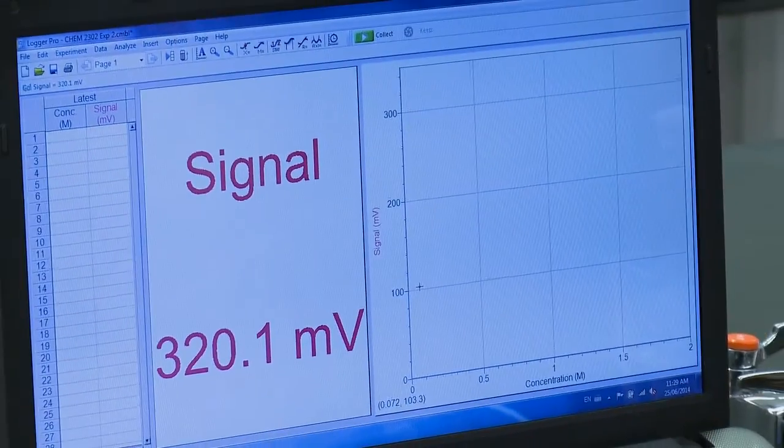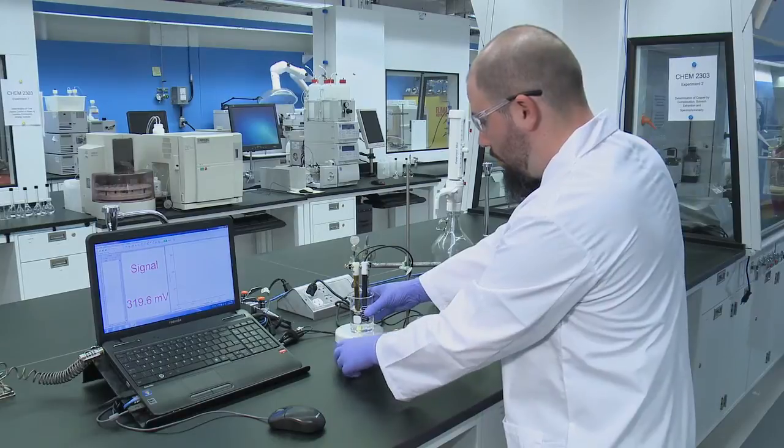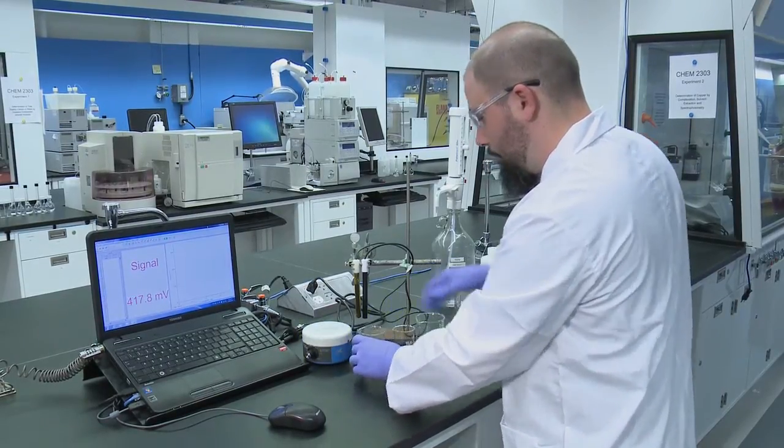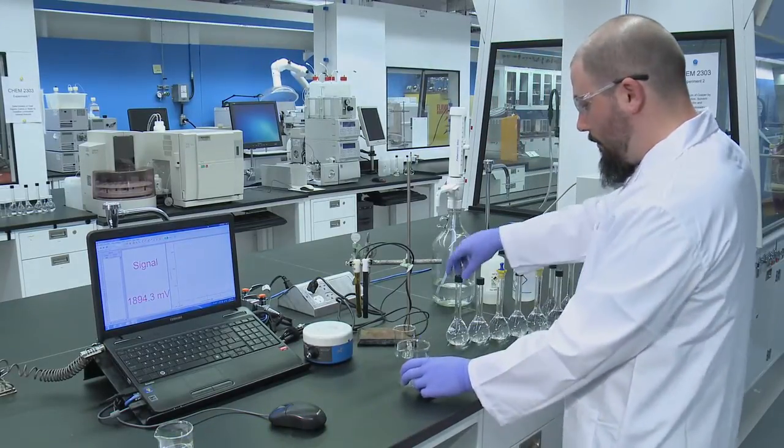At this point, you'll want to turn off the stir plate and remove the water from your electrodes. Take your first sample for measurement.